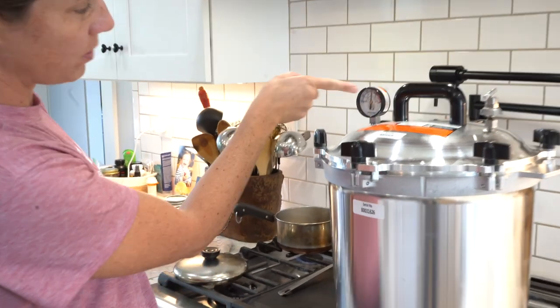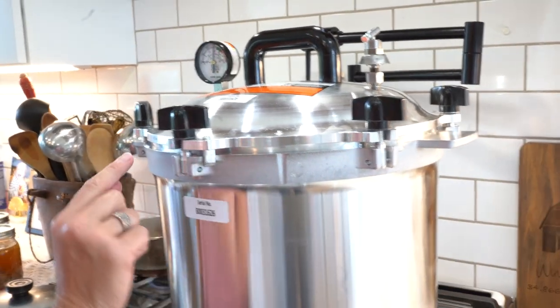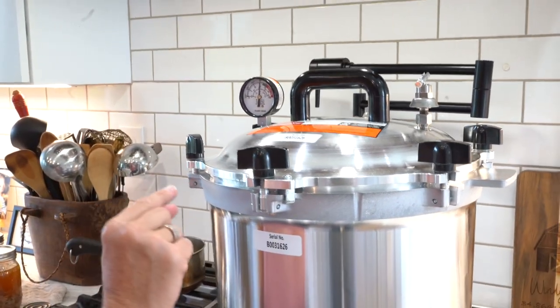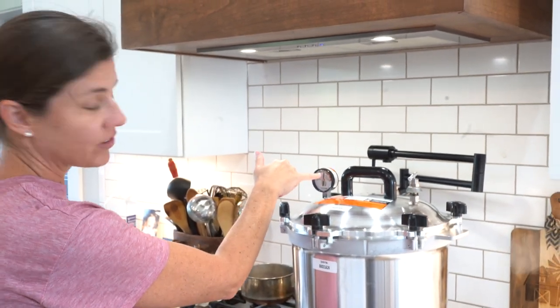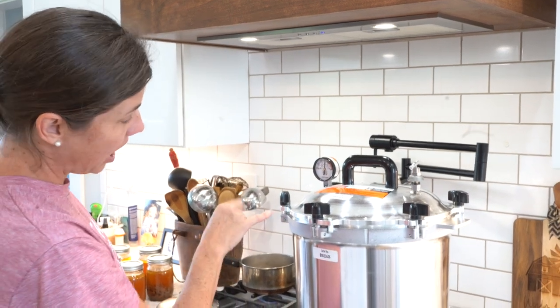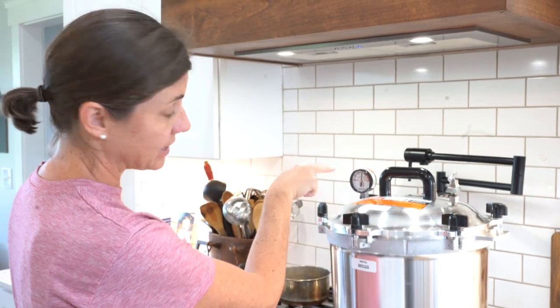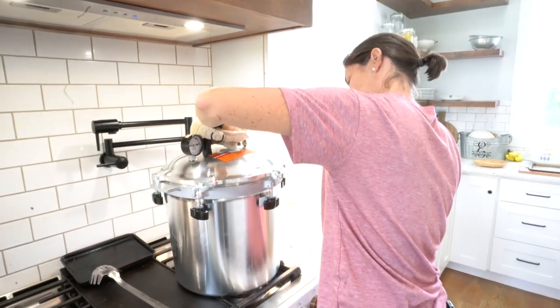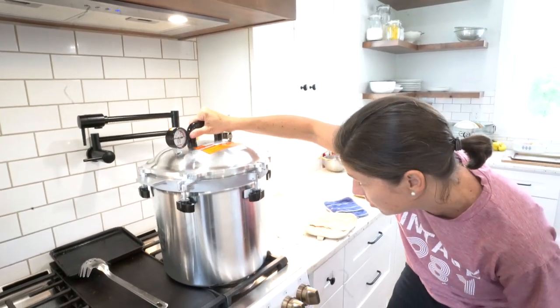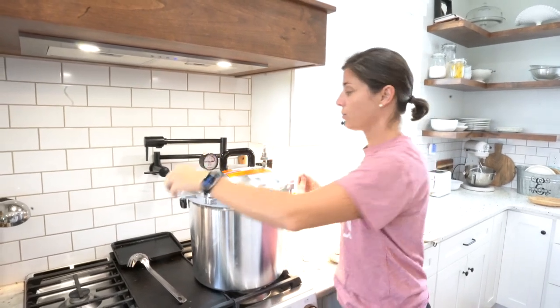We've been watching our pressure and holding at 15 pounds, but we're losing some steam in some spots — we did not get a good seal. This happened once with canning and it was just a tiny spot that occasionally lost pressure. With this sterilizer, we've been stuck at 15 for a bit so what I'm going to do is turn this off, let the pressure out, let it get back to zero, and then start the process again to get a better seal.